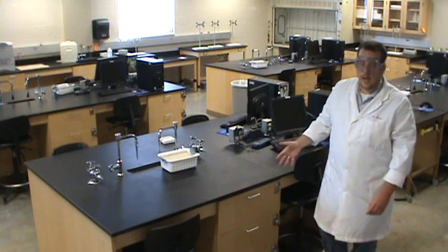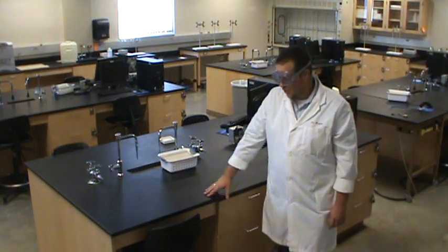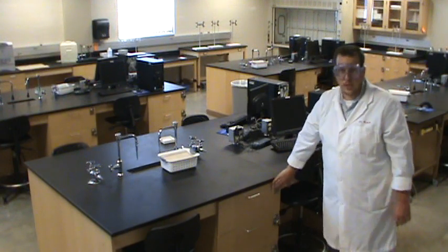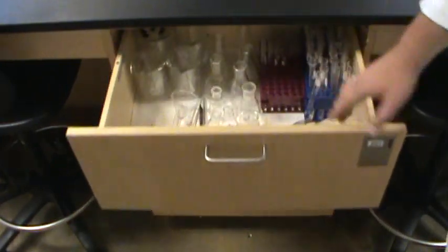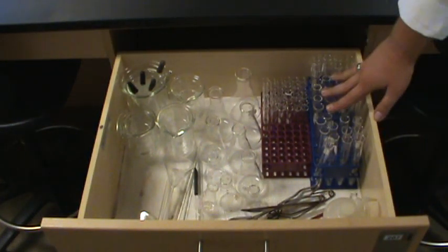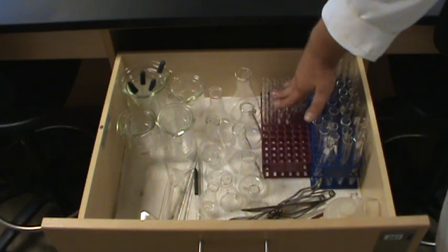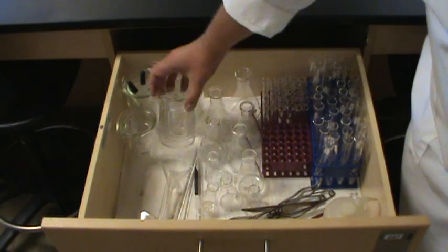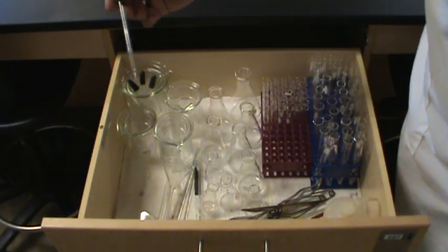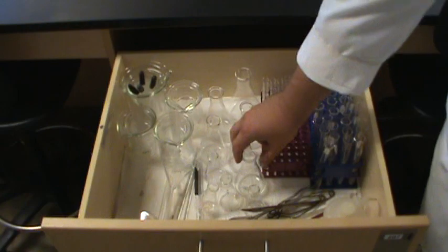Each station in the lab is designed to accommodate two students. There are a number of drawers available, but the only one that we're going to be using is the unlocked one, the top center drawer. Your drawer should contain most of the things that you're going to need for a typical experiment. We've got a rack of large and a rack of small test tubes, a number of different sized beakers nested somewhere in the drawer, some eyedroppers that'll come in handy for some of your experiments.